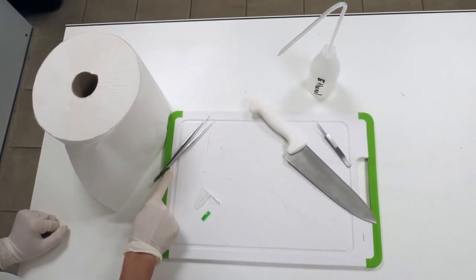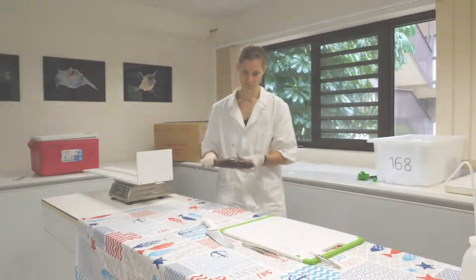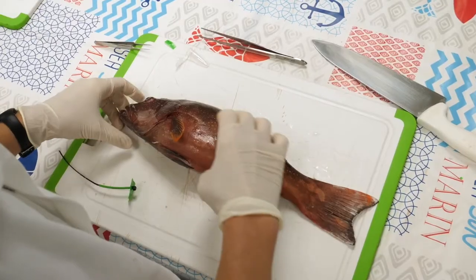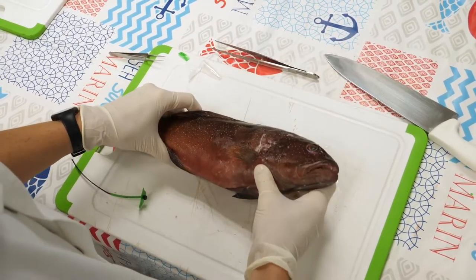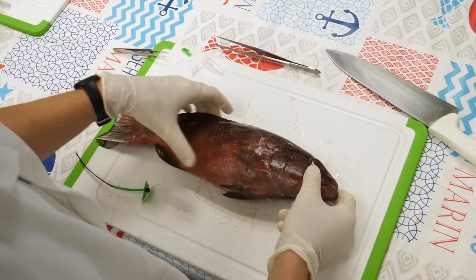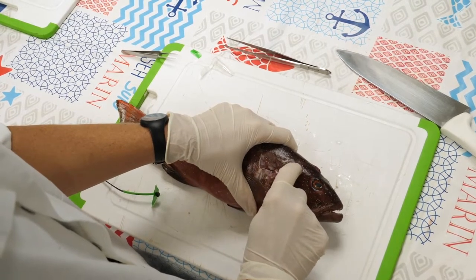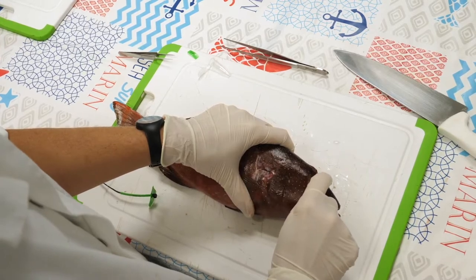OK, now you're ready! How are the otoliths extracted? Before you do anything else, place the fish on a cutting board or work surface, positioning the head on the side of your dominant hand. I'm right-handed, so I place the head of the fish close to my right hand. Using the knife, make a horizontal cut starting at the gill cover and reaching to just above the eye.